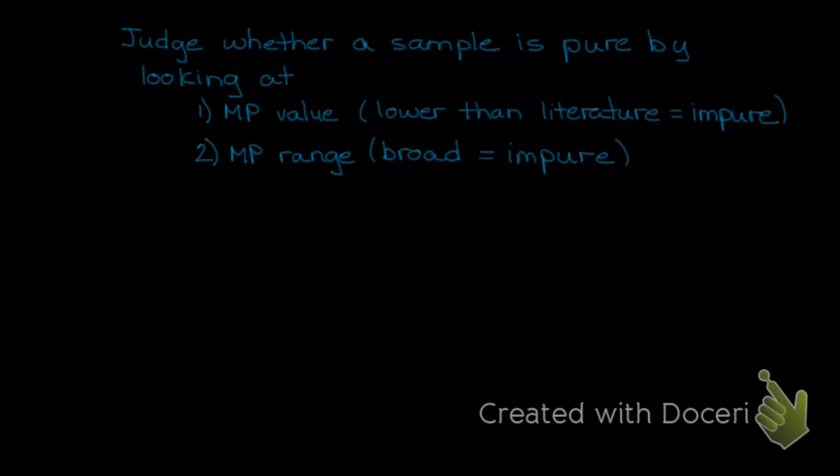Now what I'm going to do is switch over to a video camera and show you how to prepare a melting point capillary and run the DigiMelt instrument that we have to determine the melting point range of a compound.